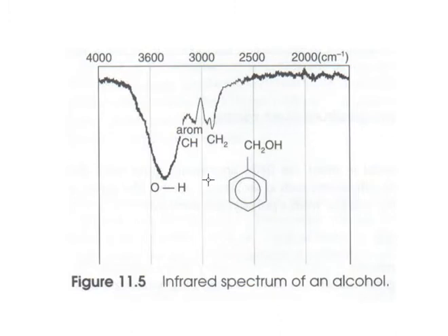This spectrum also has an aromatic ring, though it also is not the complete spectrum. It has a hydroxyl group, so there's two features in the spectrum that we'll want to examine. Two features that correspondingly will produce peaks. Well, the biggest peak here is this relatively broad peak, centered about 3500. That's due to the OH stretch of this alcohol.